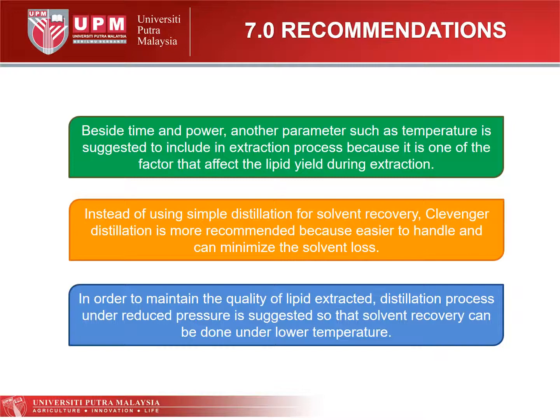In order to maintain the quality of the lipid extracted, a distillation process under reduced pressure is suggested so that the solvent recovery can be done at a lower temperature and does not affect the quality of the lipid.